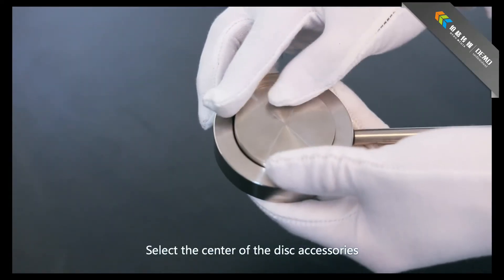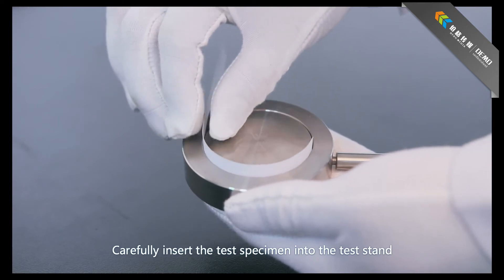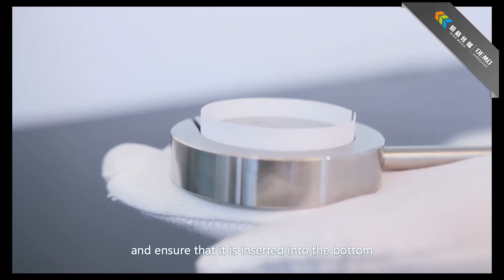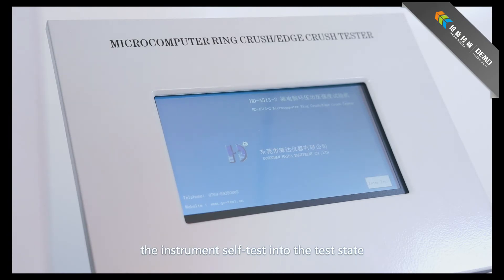Carefully insert the test specimen into the test stand and ensure that it is inserted into the bottom. Connect to the supply and turn on the power switch. The instrument will self-test and enter the test state.